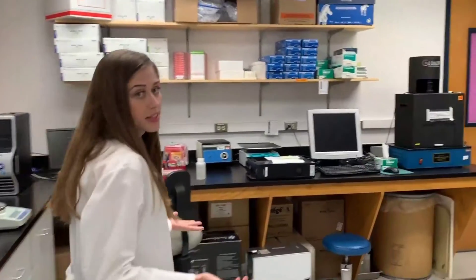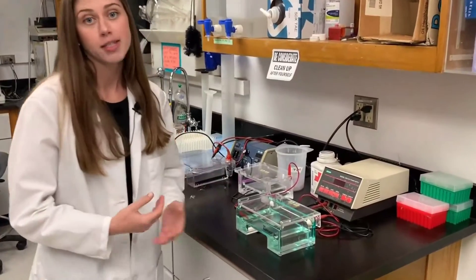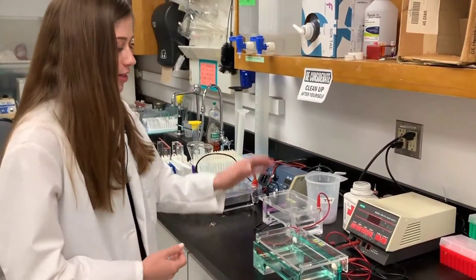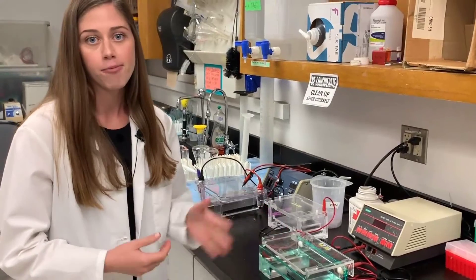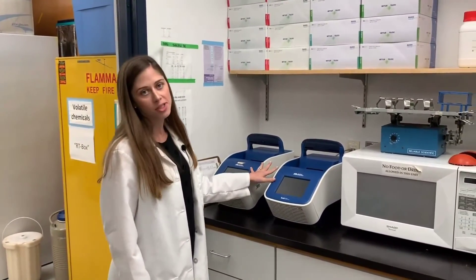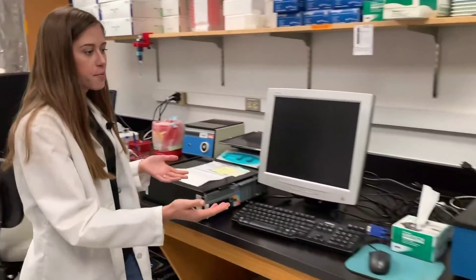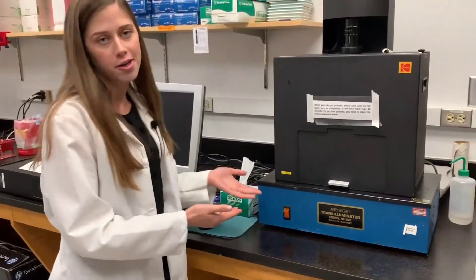This is our gel imaging room. Being molecular biologists and working with such small molecules, we use something called a gel in order to visualize what we're working with. We make them and run them in these different apparatus and use stains in order to visualize the molecules. Some other machines in this room include our PCR machines, which are basically like Xerox copy machines for DNA, our Nanodrop which we use to measure the concentration of our DNA samples, and this apparatus which we use for photography of all our gels.